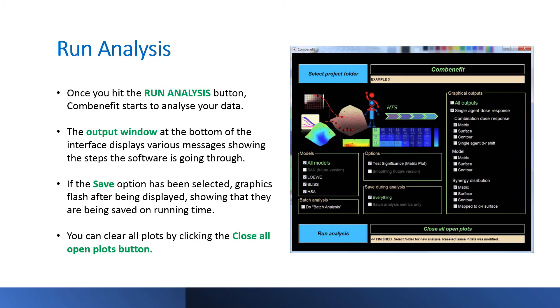Once you hit the Run Analysis button, ComBenefit starts to analyze your data. The output window at the bottom of the interface displays various messages showing the steps the software is going through. During the analysis, ComBenefit shows the graphics that have been selected by the user. If the Save option has been selected, graphics flash after being displayed, showing that they are being saved on running time. You can clear all plots by clicking the Close All Open Plots button.